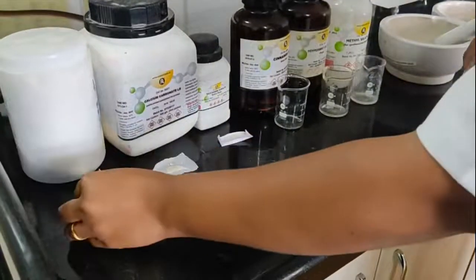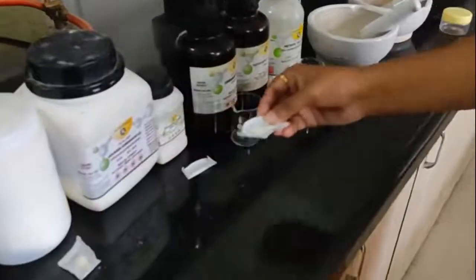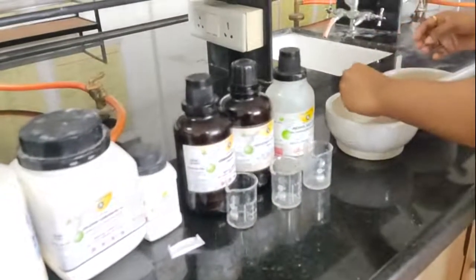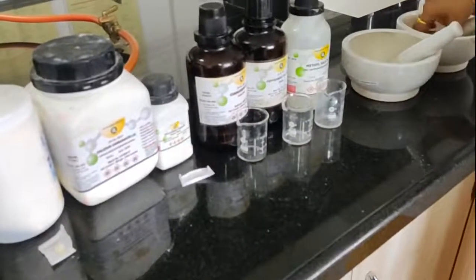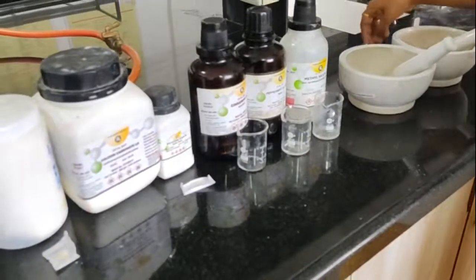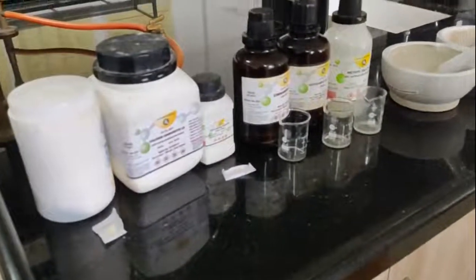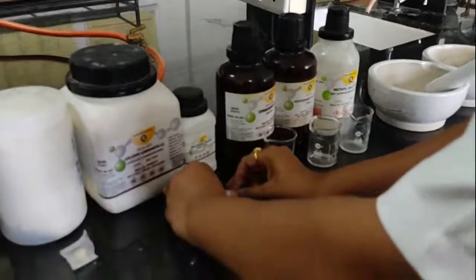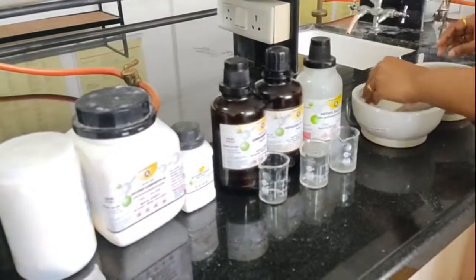So first of all, I am going to take the calcium carbonate into these two mortars. Then next, I am going to take this saccharin sodium into these two mortars.